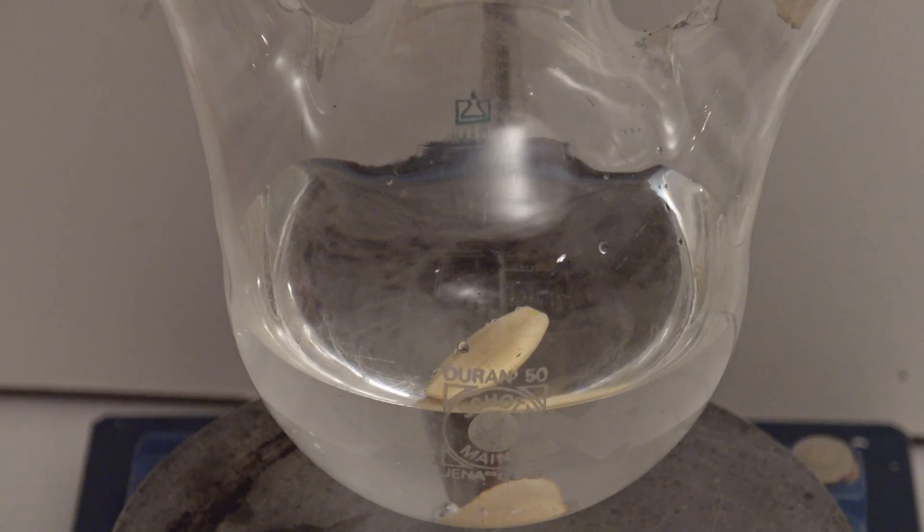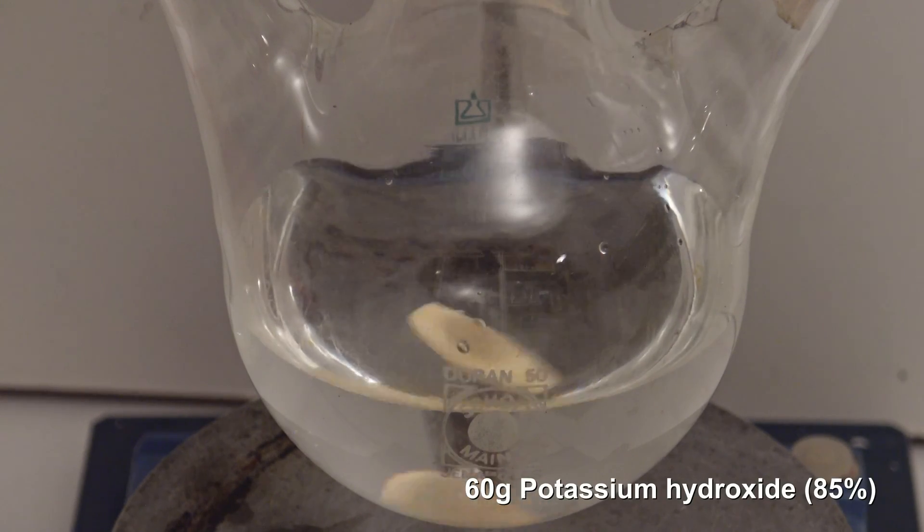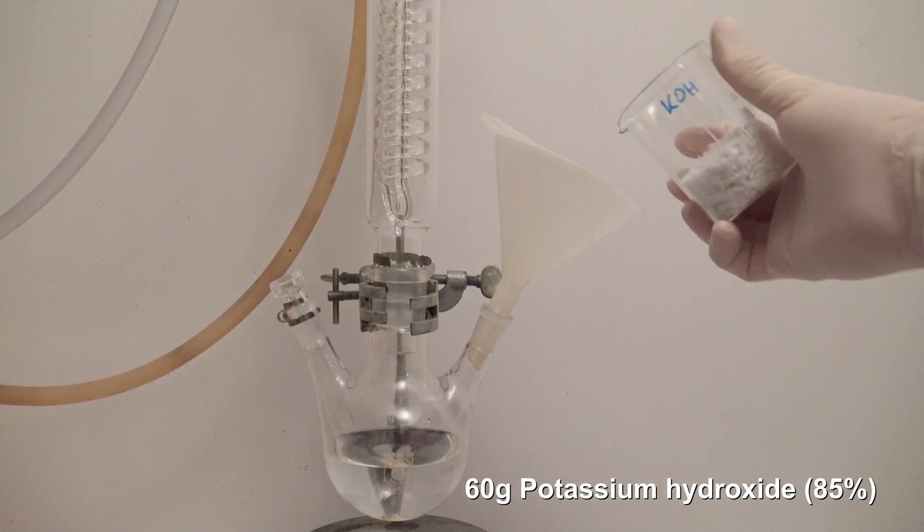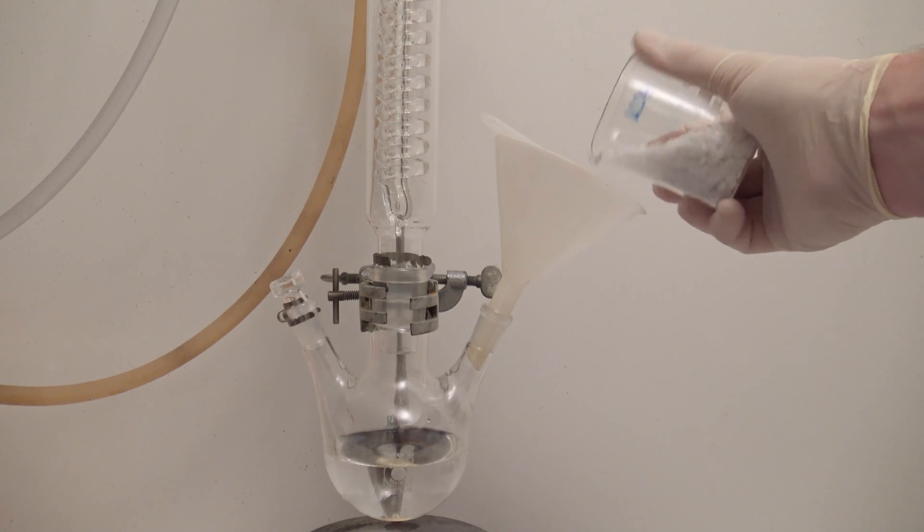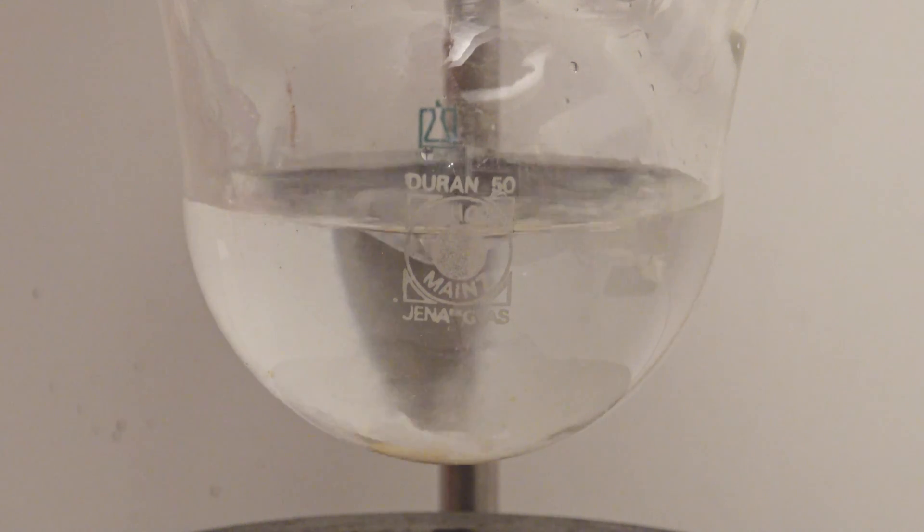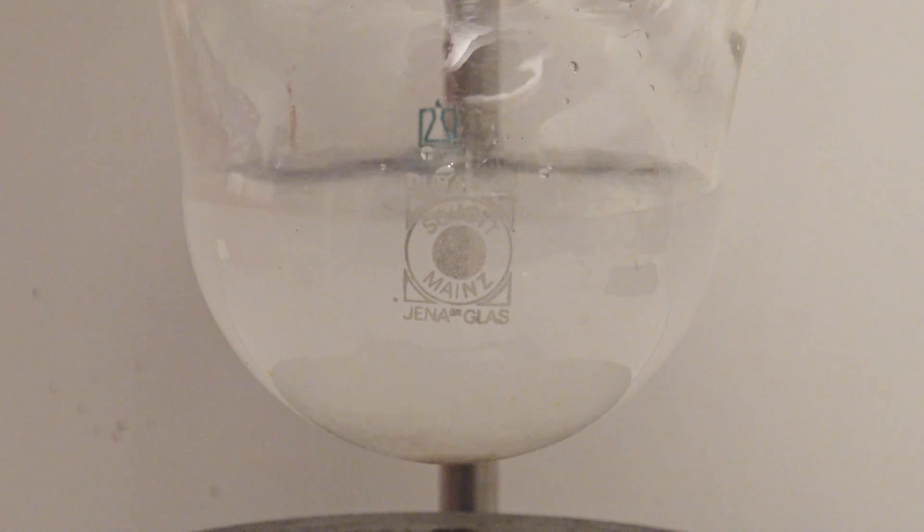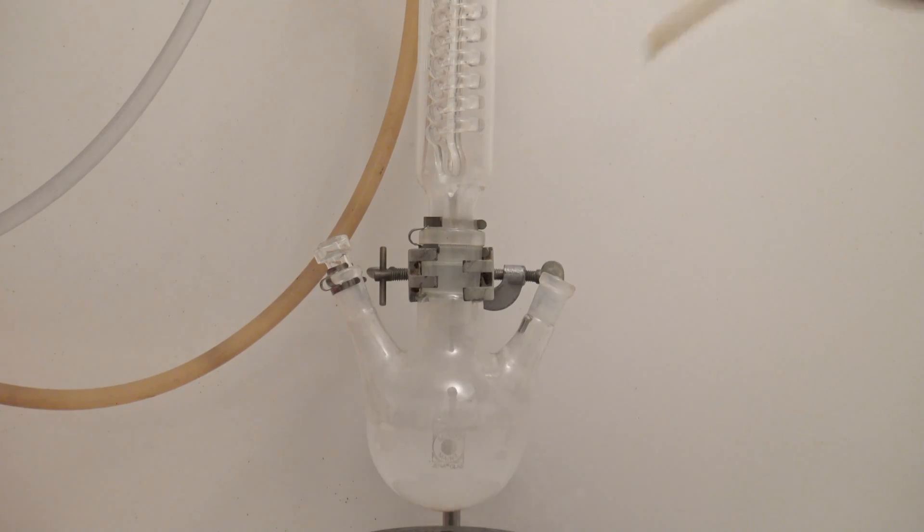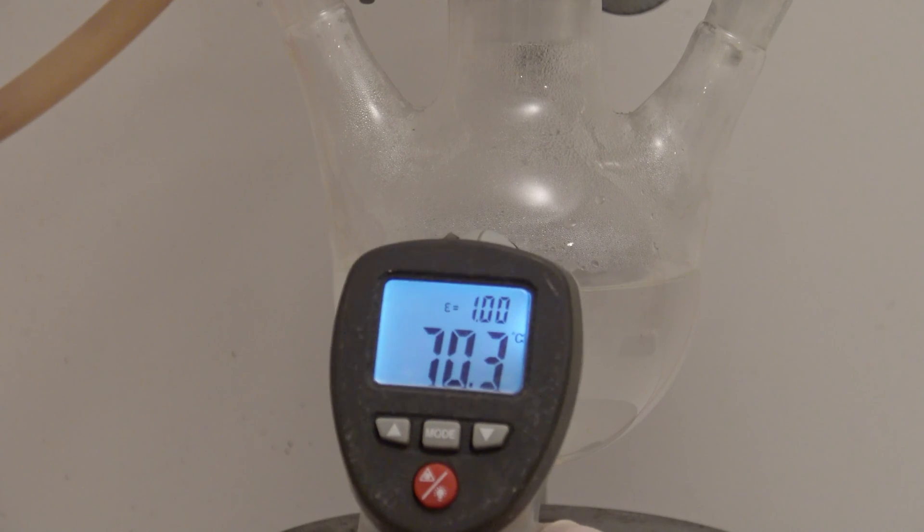Then the stirrer was turned on and 60 grams of potassium hydroxide were added. When potassium hydroxide dissolves in water, a lot of heat is released, so the water or more precisely the potassium hydroxide solution could begin to boil in the worst case. After that, the flask alone already had a temperature of 70 degrees C on the outside.